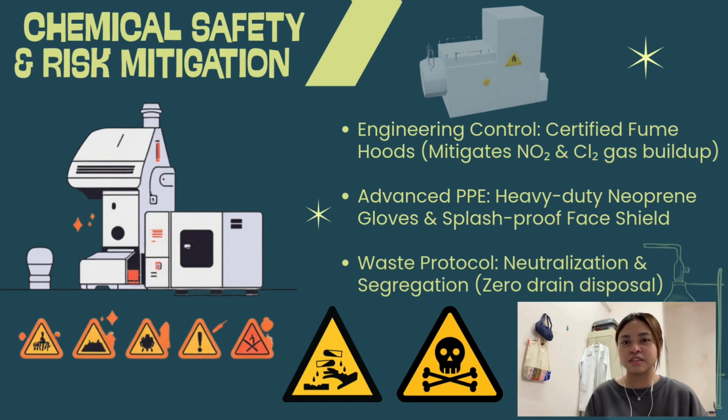When preparing or utilizing solutions like aqua regia, the reaction is highly exothermic and releases dense, choking toxic gases, including nitrogen dioxide and chlorine gas. Because of this, these solutions can never be handled on an open bench. They must be manipulated strictly inside a certified, fully operational fume hood, with the sash kept at its lowest safe working height to protect the analyst from inhalation hazards.